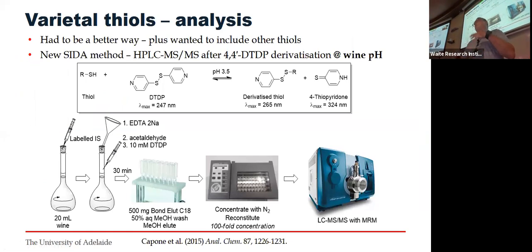So I went and had a look at the literature, and there are different ways to derivatize things. Renata helped do some of this work, actually first began this work with just a tiny little seed grant from what was Wine 2030 at the time. And we kind of flipped this around.